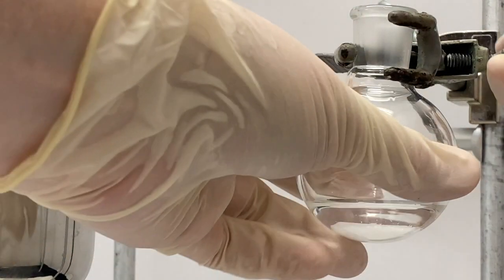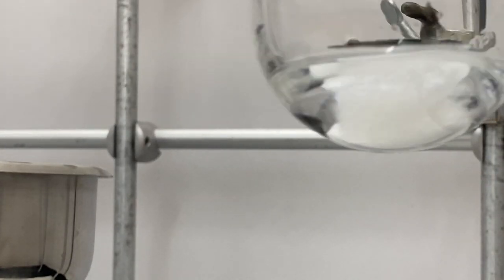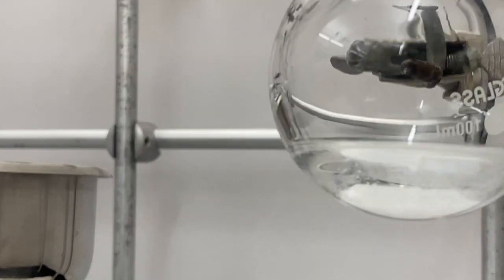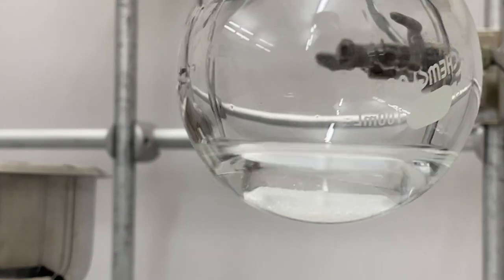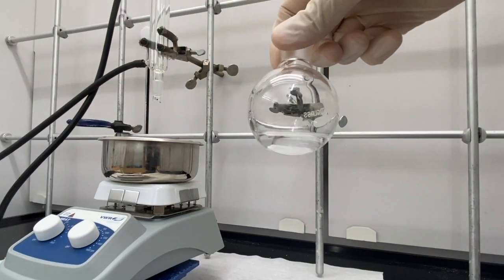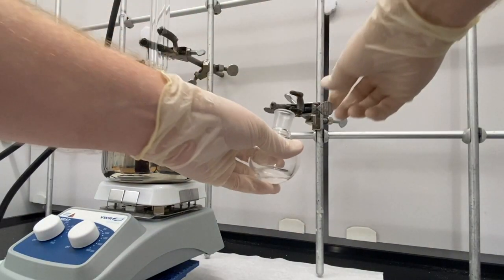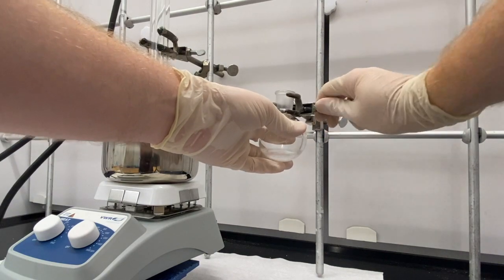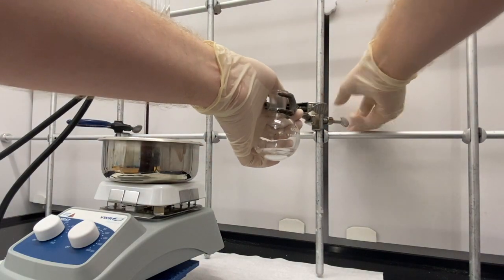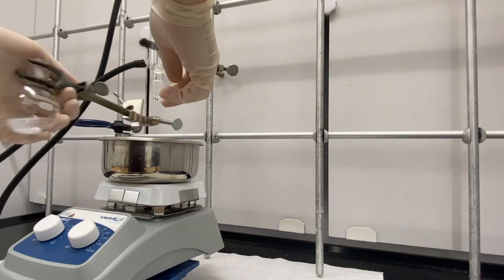There's a bunch of solid right there that hasn't dissolved. So now I'm going to have to heat this on the sand bath with a reflux condenser and let it dissolve. I'm going to move this over the sand bath, which I have in this metal dish here.